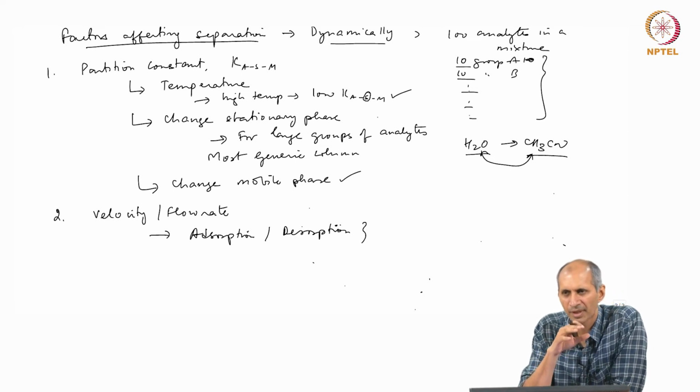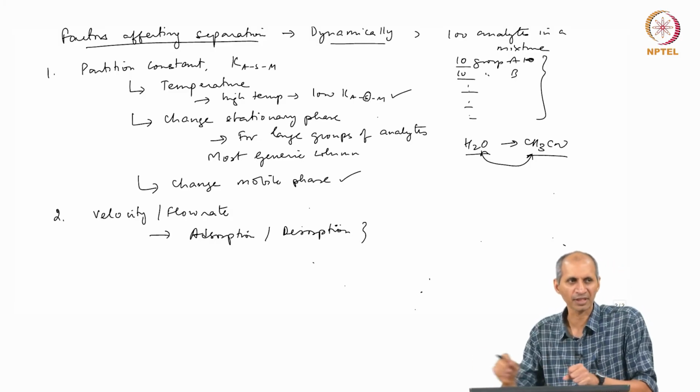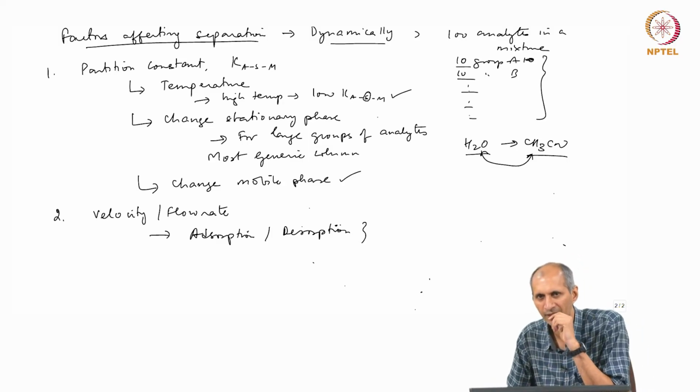you need to know that if you are looking at separation, you would like more time to be spent in the column. That is the only way you are going to separate. You are going to stretch the separation. That is the only way. If you hurry compounds to come out, they will not separate. They are likely to get clubbed together.